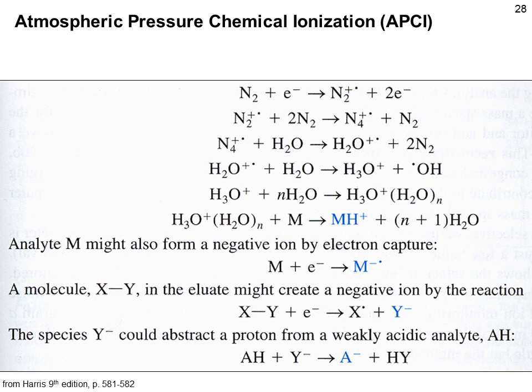The reactions happening during atmospheric pressure chemical ionization, APCI, are quite complex. They are, as I said, somewhat comparable to what's happening in a lightning. For example, molecular nitrogen, a fairly inert molecule, can be ionized. It can transfer charge to water, and water in turn can transfer a proton to the molecule M, generating positively charged MH+. Don't worry about the details here, but remember that inert molecules are activated to ionize your analyte molecule.